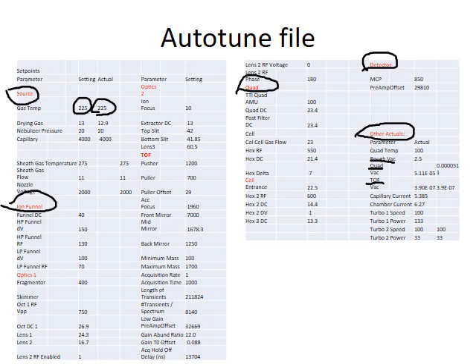Another parameter worth mentioning is the MCP value. When the detector was first installed, MCP value should be optimized and appear relatively low. When the usage of the instrument has become more frequent and the tuning has been regularly performed, MCP value will be gradually increased. The comparison between the installation value and the current one will indicate the performance of the instrument.